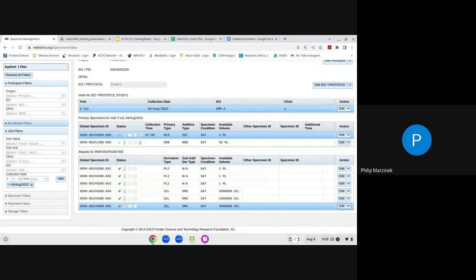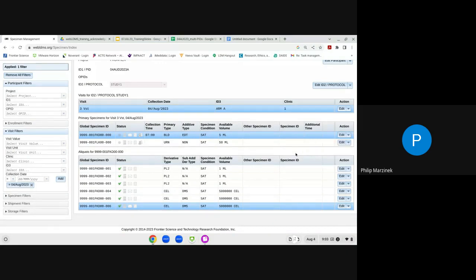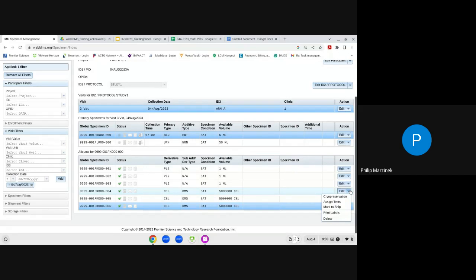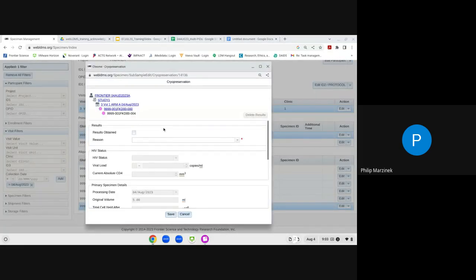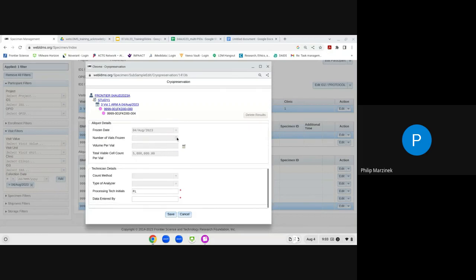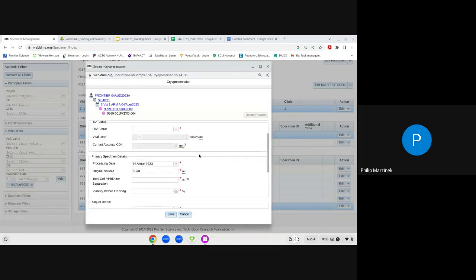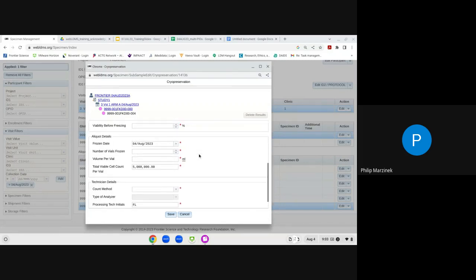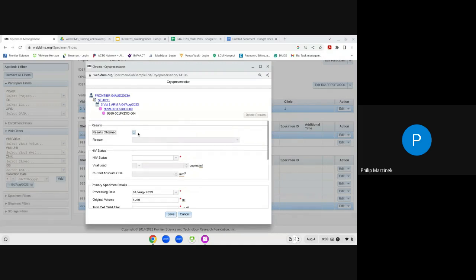Other features in the participant record include drop-down menus next to the edit buttons on primaries and aliquots, allowing you to assign tests to specimens, mark specimens to ship, and print labels for individual specimens. For PBMC samples there is an additional Cryopreservation Details feature for specific clinical trial networks, where you can click Results Obtained and fill out additional data around HIV status, primary status, aliquot details, and technician details. Click Save to implement any changes.